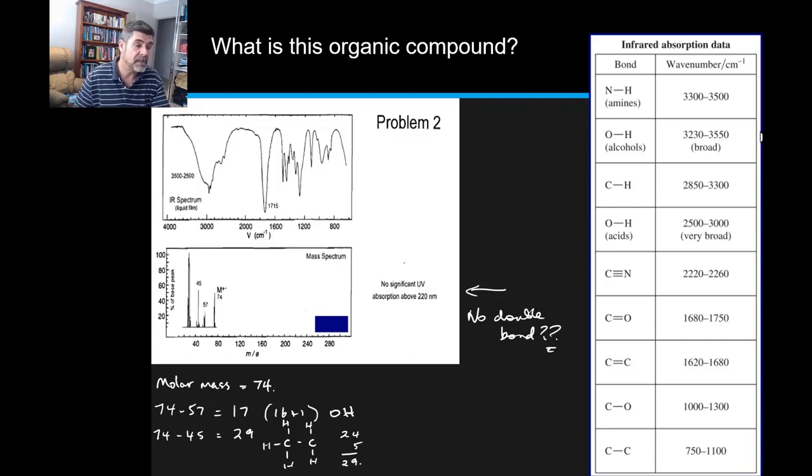So now I'm going to go up to the IR spectrum. Now the IR spectrum is showing me something interesting because I would expect a nice broad tongue for around the 3000 region up here to indicate the presence of the OH group that I think got cracked off this molecule. But when I look at it, it's not the tongue, it's the hairy beard. So that means that I've potentially got a COOH group.